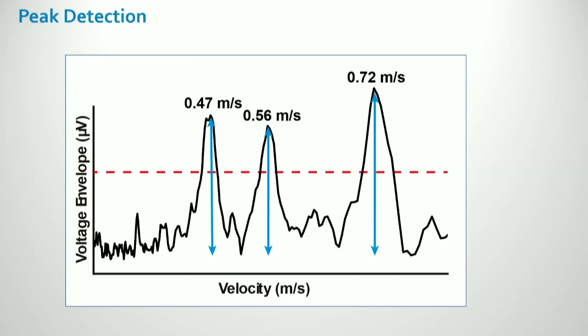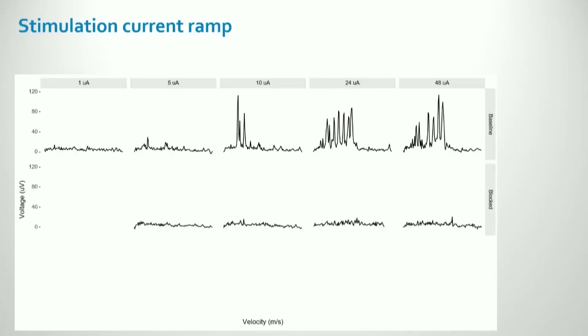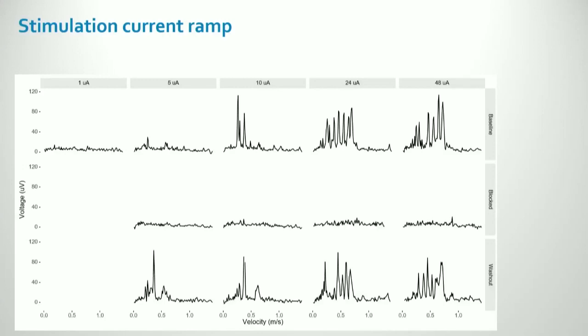in one particular area, is that tied to a specific ion channel? Is that tied to a pathology that is manifesting from a disease line? And we're also seeing, because of the platform, we can do current ramping, much like you do in an in vivo study. So now, can we stimulate certain neurons based upon the electrophysiological parameters that are being input there? We can block those and then rescue them again and have them come back. And what was interesting in this study was this now sets the stage for us doing even a sensitization of the neurons to be able to do a number of different studies with it.